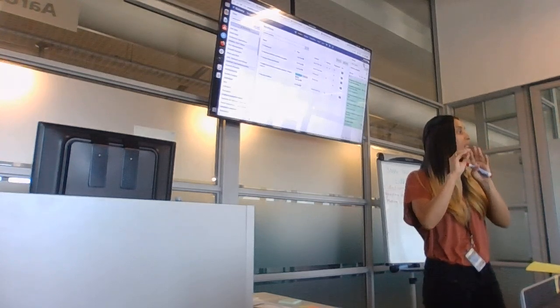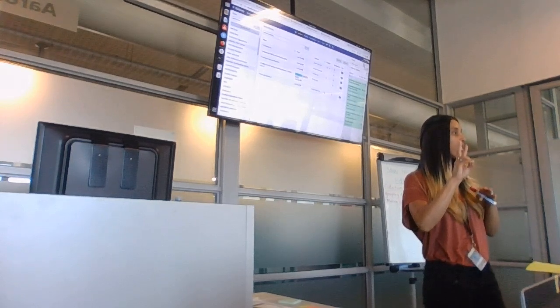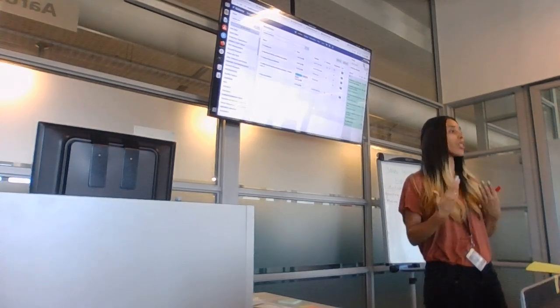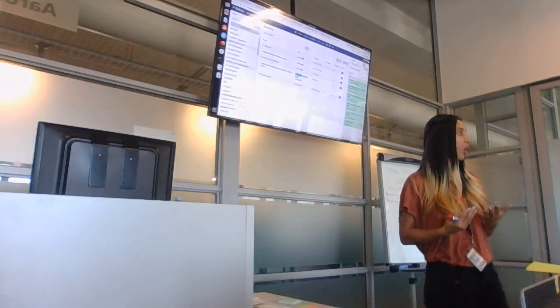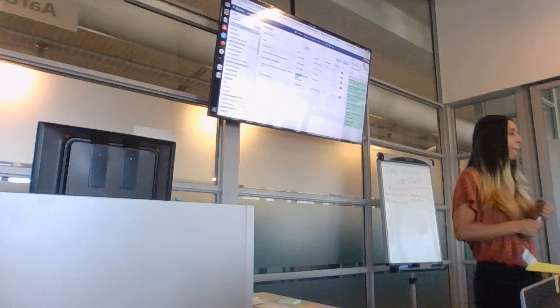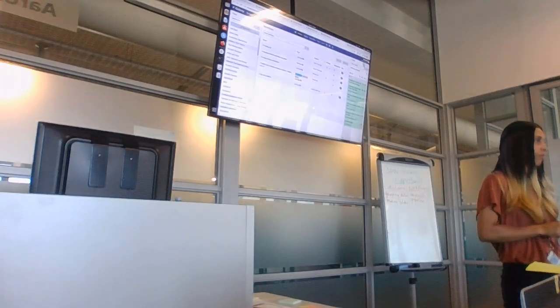So we took one file, the one that ends in 88, but there were actually 2, right? There were 2 files, but we just did it on one just for practice. And then we didn't actually run the tool because we said it was going to take long. So there you don't upload the files that you ran the QC on, but the initial files.